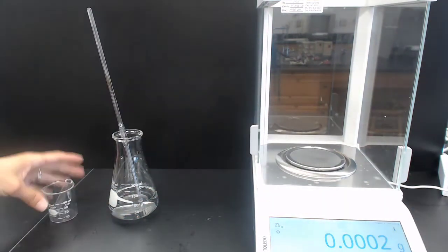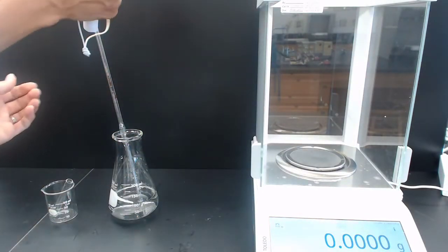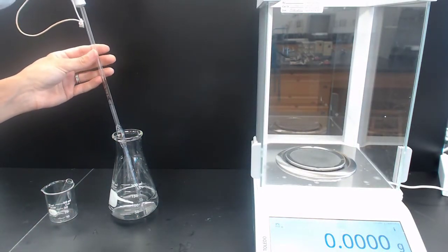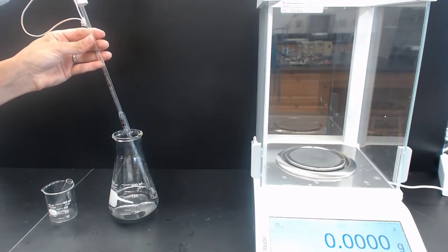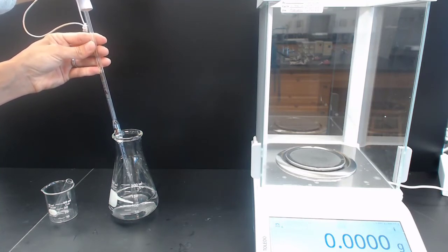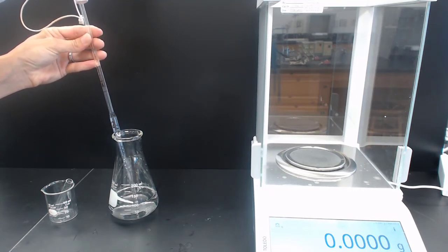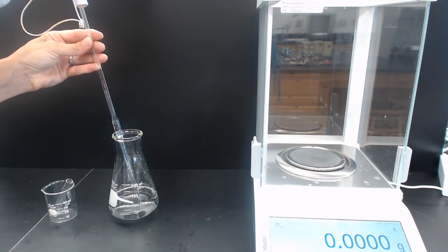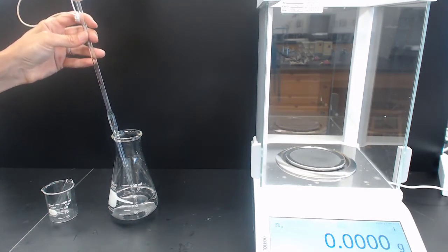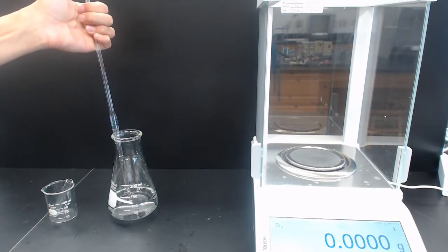We'll have our beaker ready here. What we're going to do is take our bulb, slightly press it, and place it on top of the volumetric pipette. We're going to let go slowly, and we'll watch the water level move up the pipette. We'll want to pass the calibration mark, but come towards the bulb, however, not allowing the water to enter the bulb. At that point, I'll remove the bulb and replace the top of the pipette with my hand.